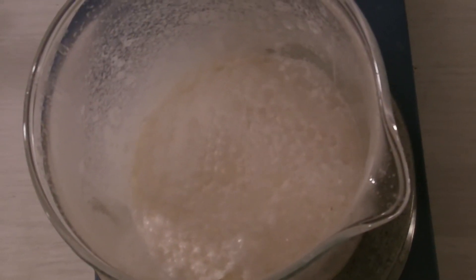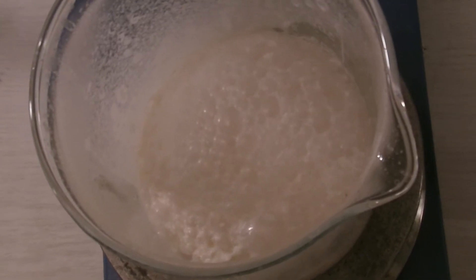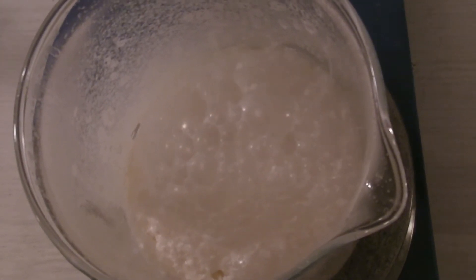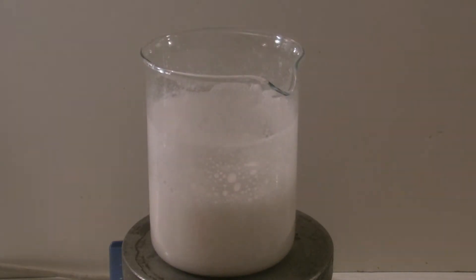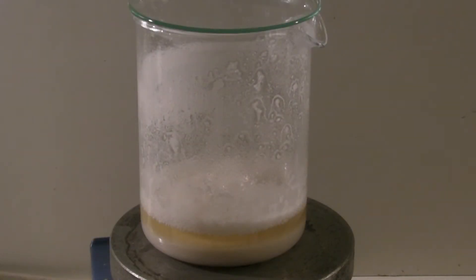In the end the mixture foams a lot so that it can't be stirred anymore. By swirling, the amount of the foam could be decreased. When the foaming was finished, it was cooled down and kept overnight at 4 degrees C.